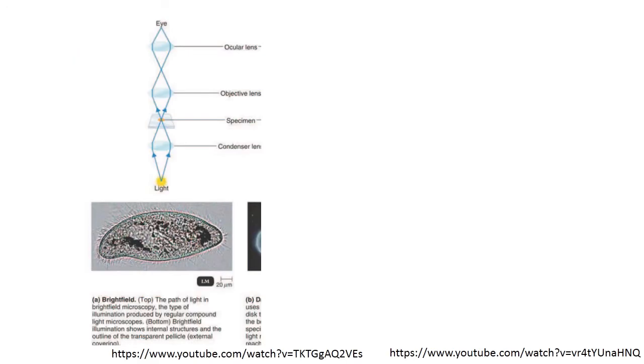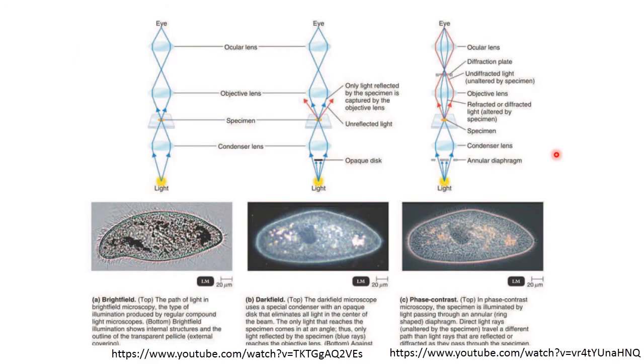In the phase contrast microscope, the contrast is produced because of interaction of light rays with one another when their phases change, and the way the light rays undergo this process of interference produces a contrast. So this is a picture taken by using a phase contrast microscope shown in this panel.